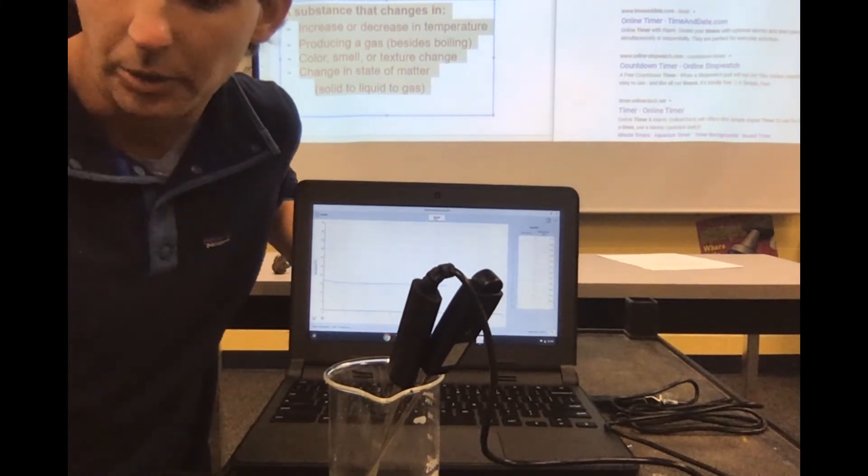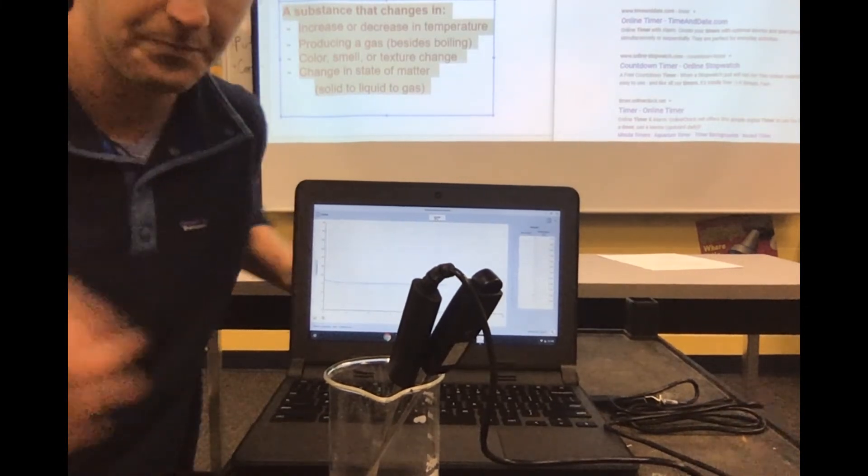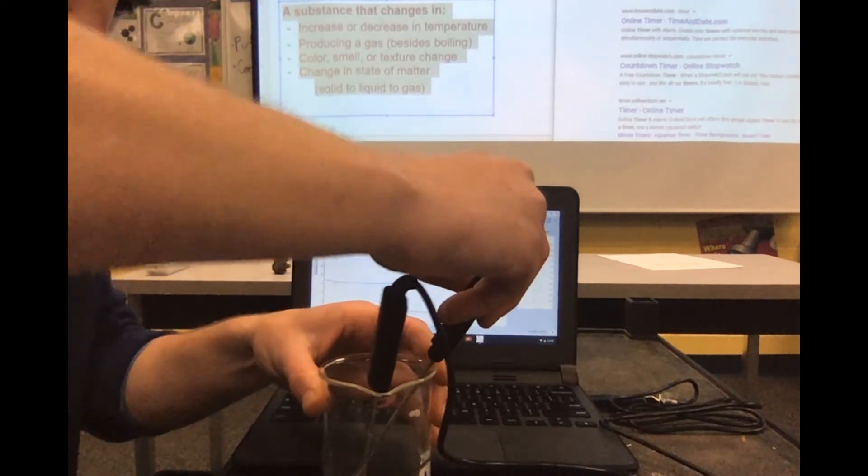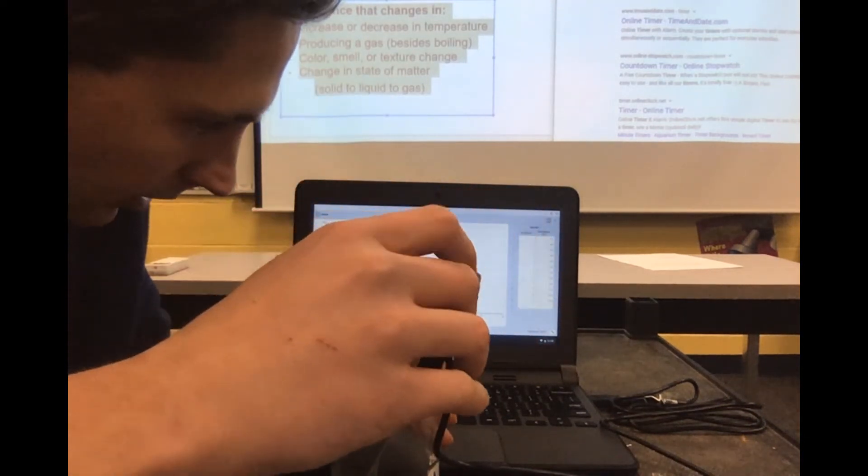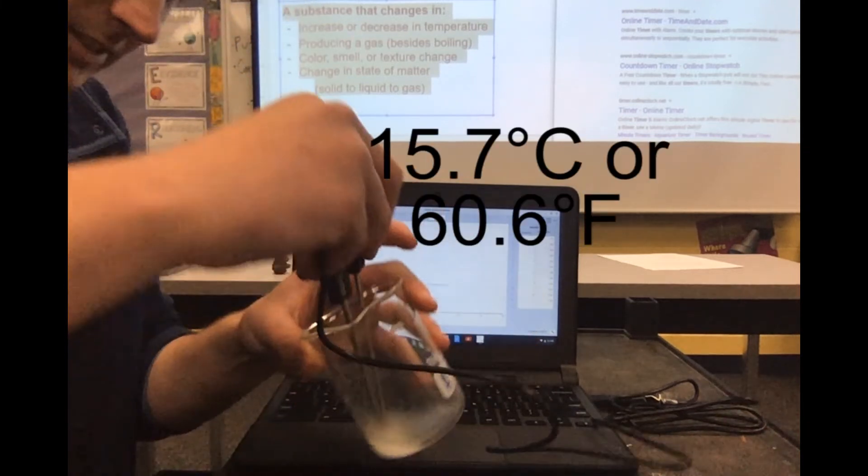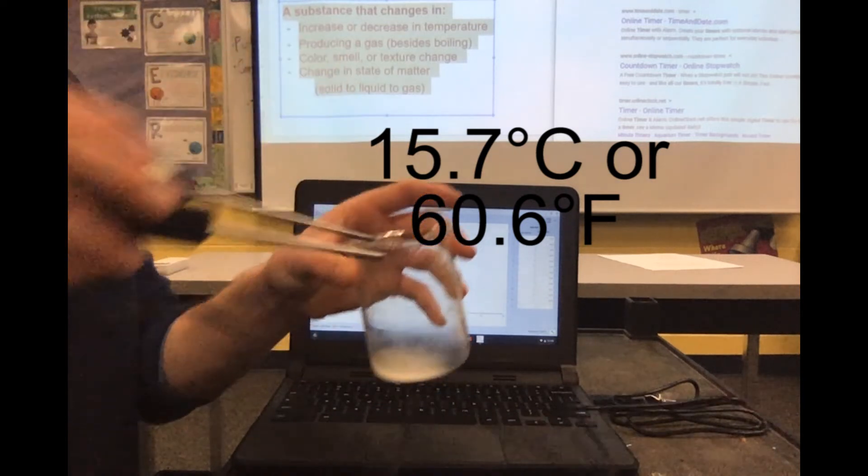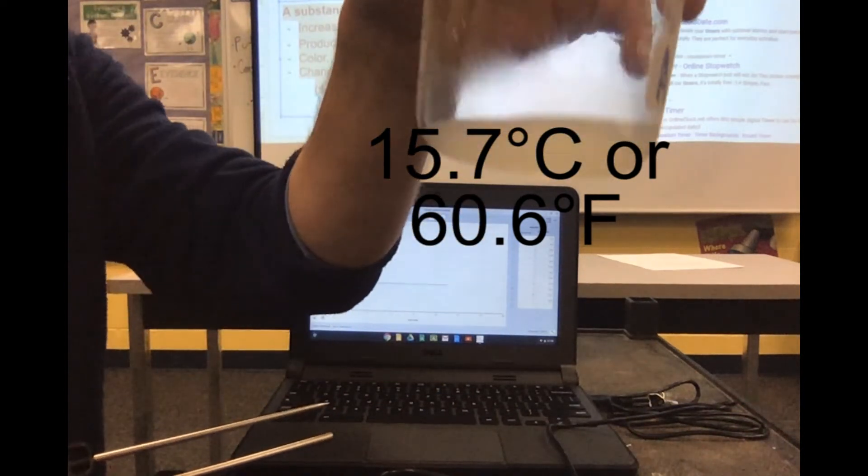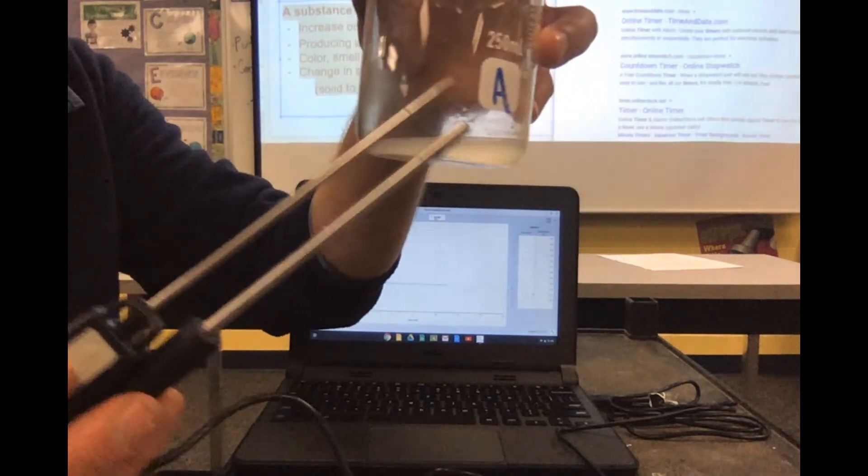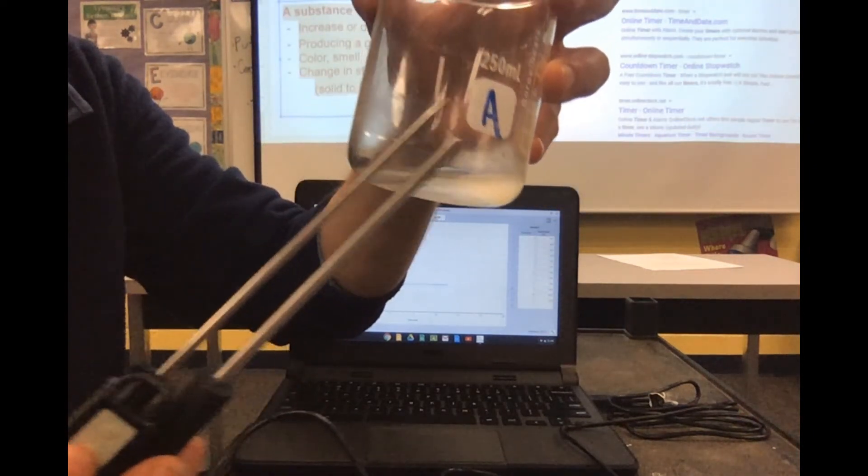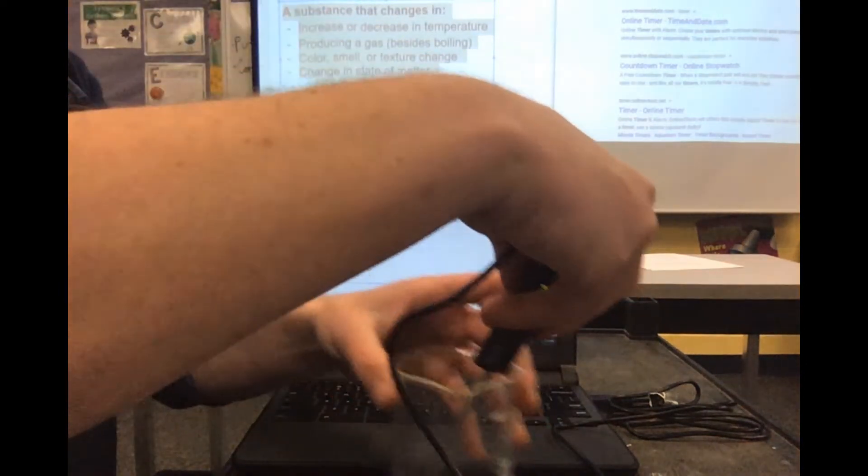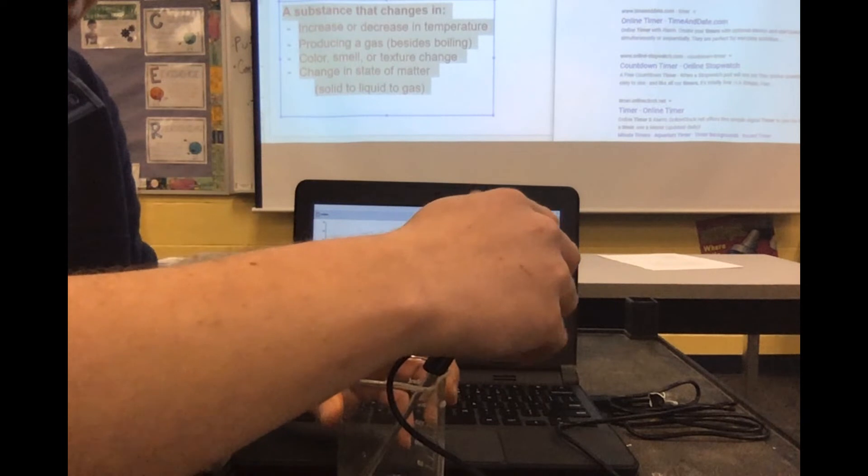Here we are, repeat. Okay, 15.7, 60.6. Looks like it's getting smaller and smaller. Look at that white residue left on the edge of the glass as well. Those are good observations to write down.